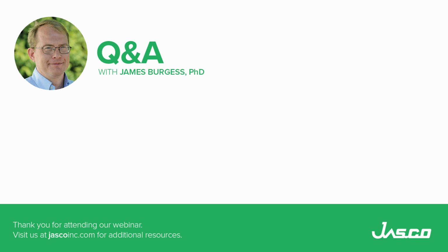The angle of incidence is going to depend on the Cassegrain. James is going to be making a presentation in 2 weeks about FTIR microscopy, and we are going to be talking about the different objectives of the Jasco FTIR microscope. Nevertheless, a 16x Cassegrain, that is a magnification that we use, has an incidence angle of 27 degrees, and the Cassegrain of 32x, the other magnification that we use, is 32.5 degrees.